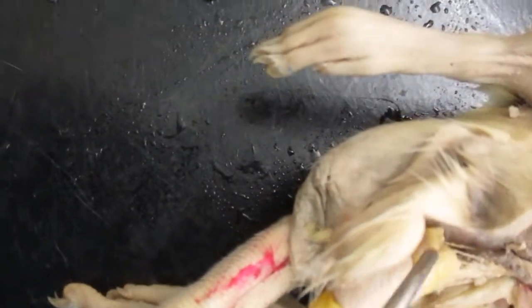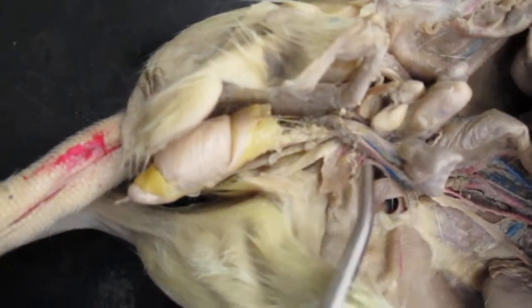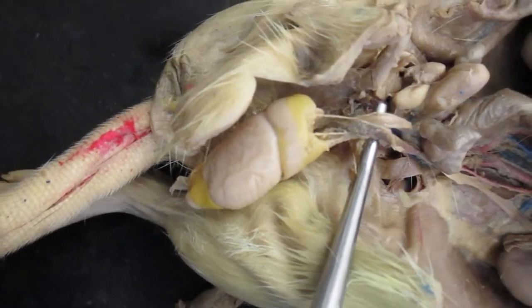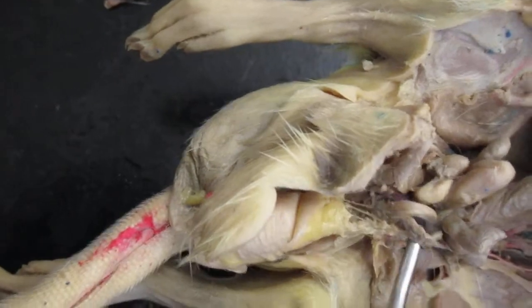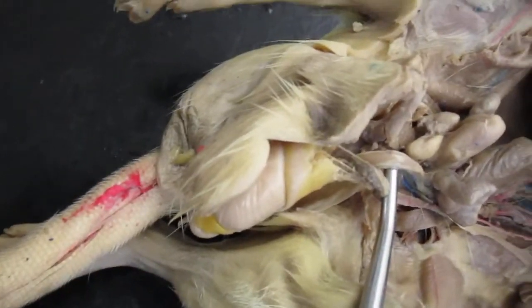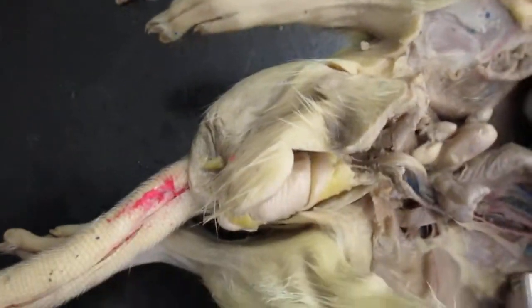Epididymis is right here. Now, here you can see the spermatic cord. See that? Going down into the inguinal canal. Testicular artery and vein is this right here. And then you can see the vas deferens right here. Okay?